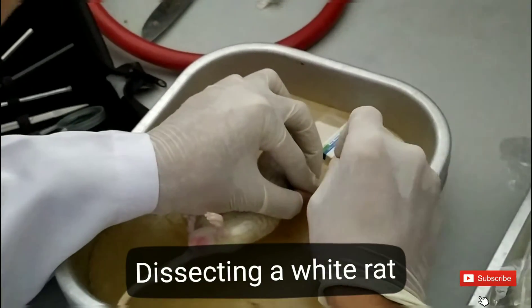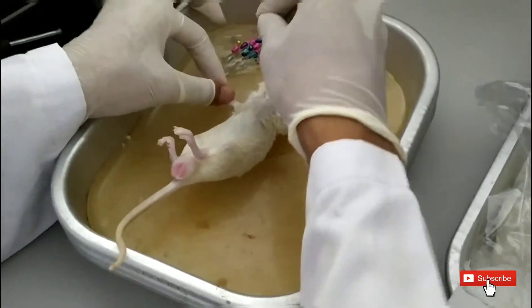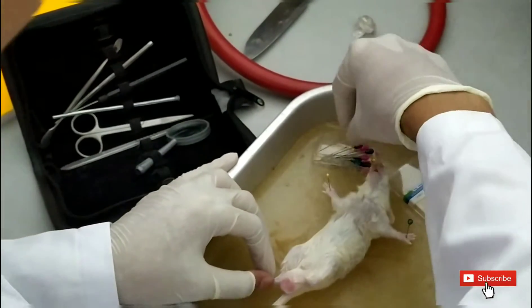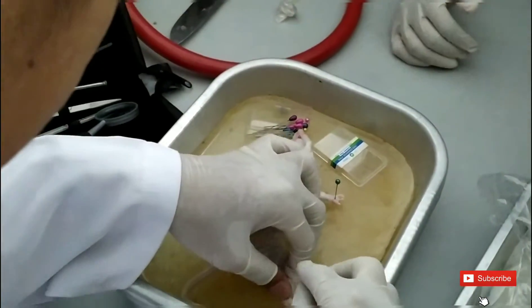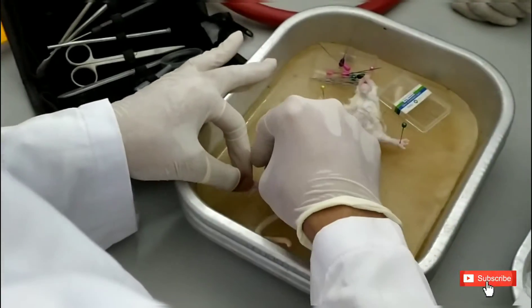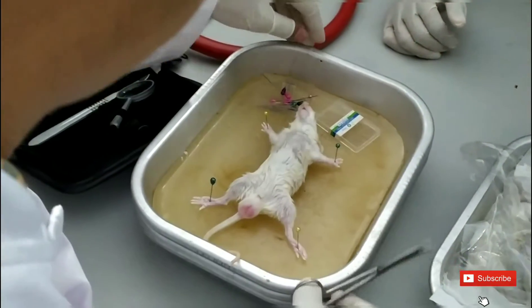Today we will be dissecting a white rat. This is a dyed white rat — we put some alcohol solution to make it die. After that, we used wax and put some needles on the limbs. We put four needles to make it easier to dissect from the bottom part.